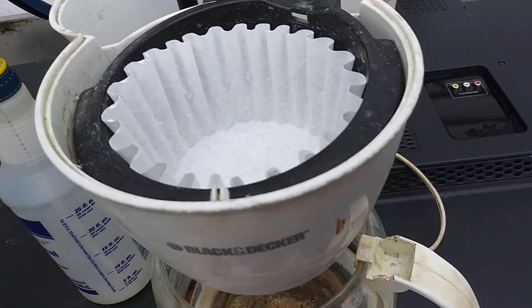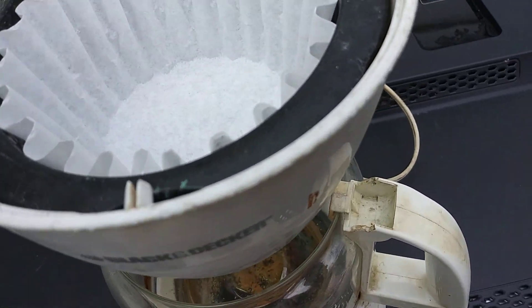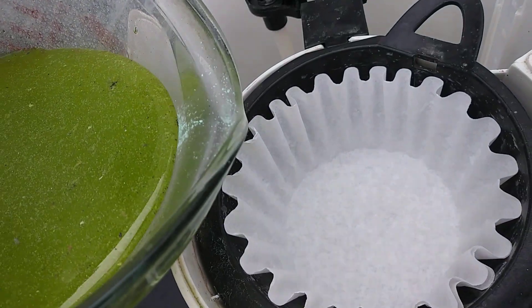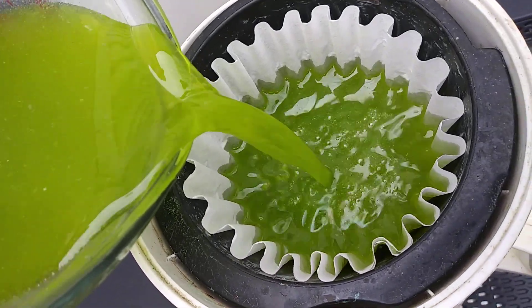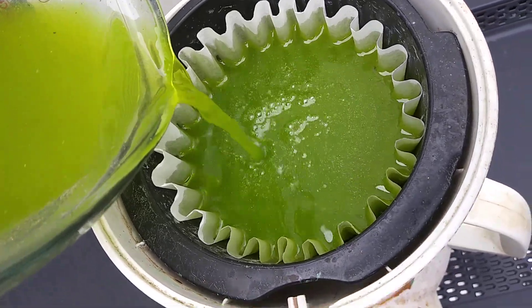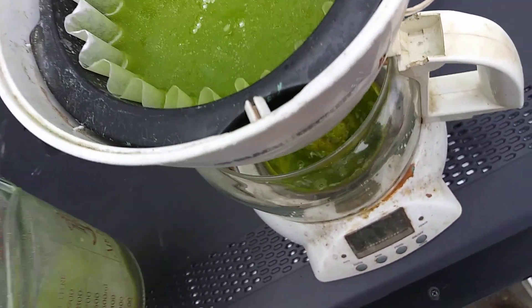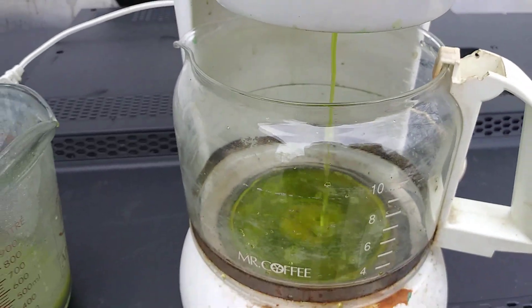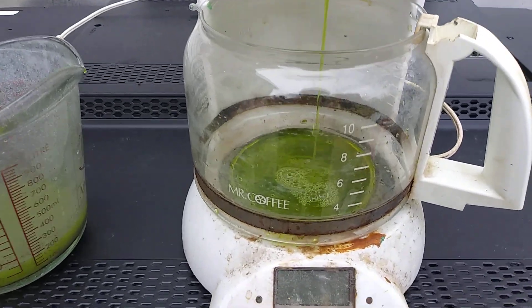Alright guys, part two. I put my assets and all that stuff away. Right now we're gonna just pour this into this filter and just let it filter through. Sometimes it'll go quick, sometimes it takes forever. Let's see how long it'll take to filter through.